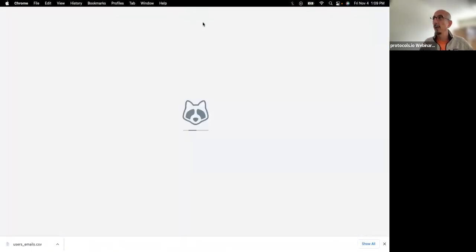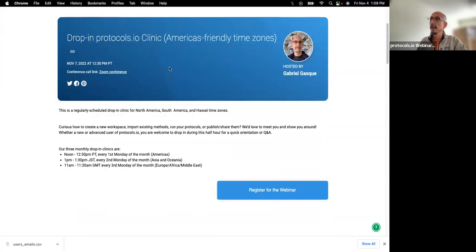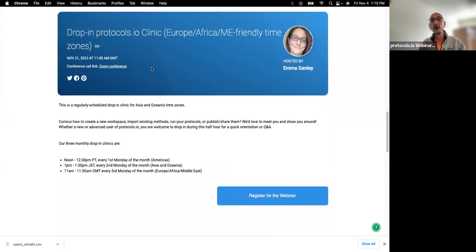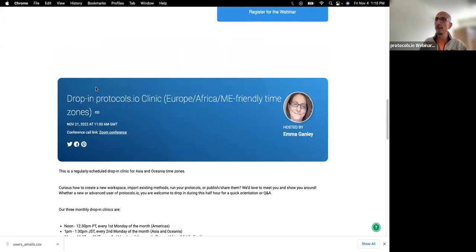protocols.io/webinars, which I will open on the internet, you will see that we have scheduled webinars targeting different time zones. Some are introductory webinars like this one today, and some are more advanced. We also have what we call drop-in clinics, which are like office hours. These are sessions that don't have an agenda, and you can come with specific questions about the platform and talk to one of our staff.